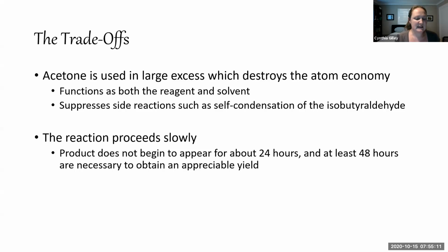The reaction proceeds slowly, so this is a trade-off as well. The product does not even begin to appear until about 24 hours, and at least 48 hours is necessary to obtain an appreciable yield. I think in the video they let the reaction go for an entire week, so that's a lot of time that you have to wait for a reaction, which is a negative.